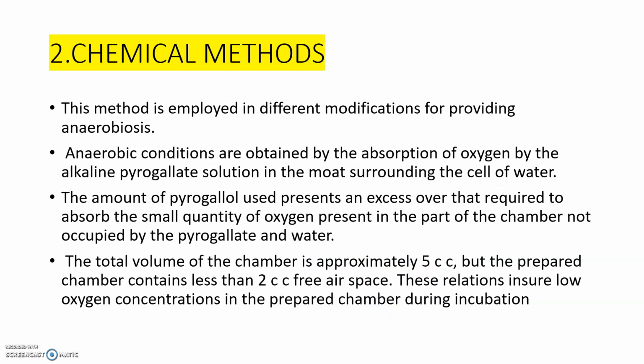So these all come under the removal of oxygen and filling the jar with other gases. The second method is chemical methods. The method is employed in different modifications that can provide anaerobiosis.